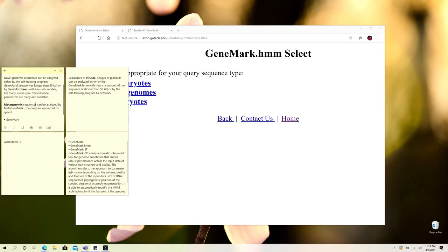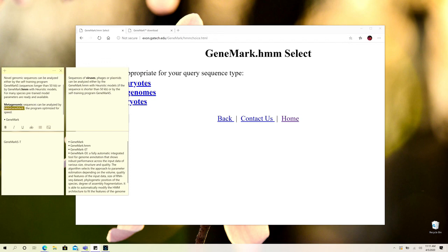Metagenomic sequences can also be utilized through the GeneMark suite, and that particular software is known as MetaGeneMark. As you can see over here, it is the MetaGeneMark tool that is present within the GeneMark suite and you can utilize it for your metagenomes for the prediction of genes.